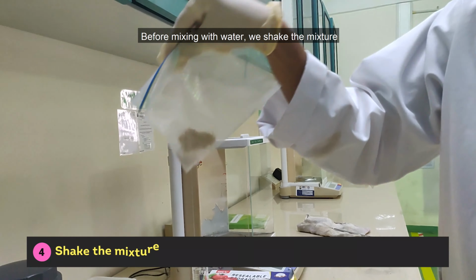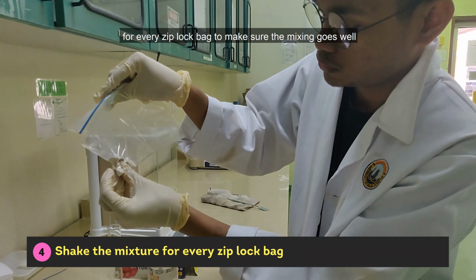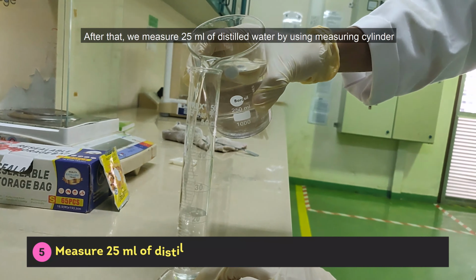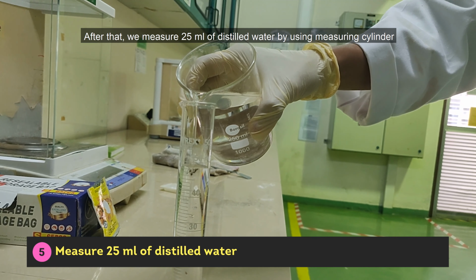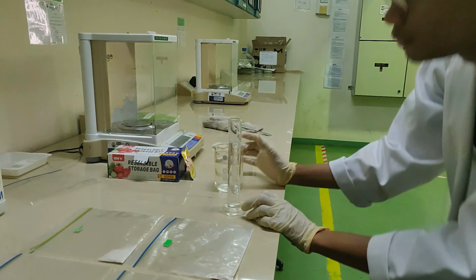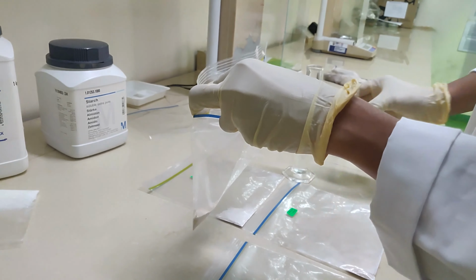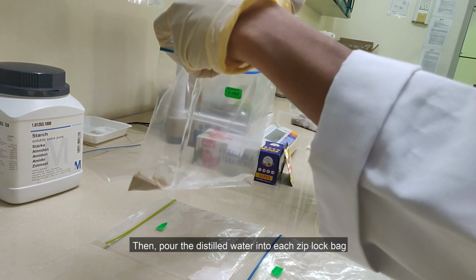Before mixing with water, we shake the mixture in every Ziploc bag to make sure the mixing goes well. After that, we measure 25 ml of distilled water by using a measuring cylinder. Then, pour the distilled water into each Ziploc bag.